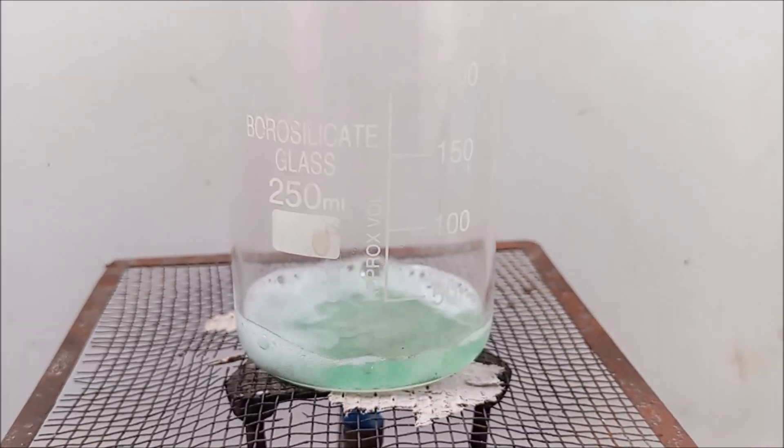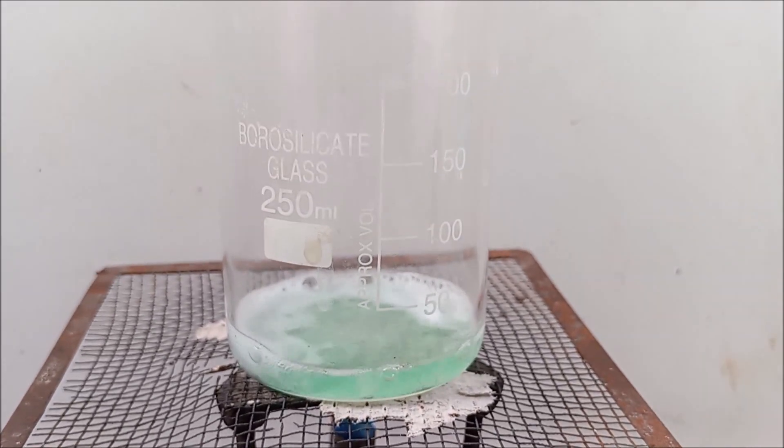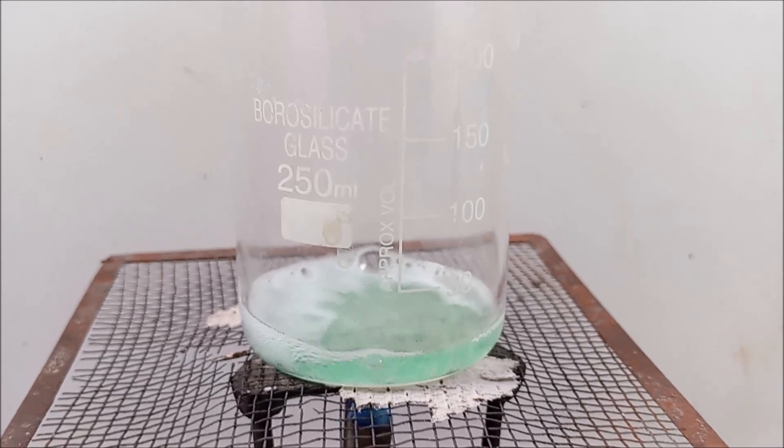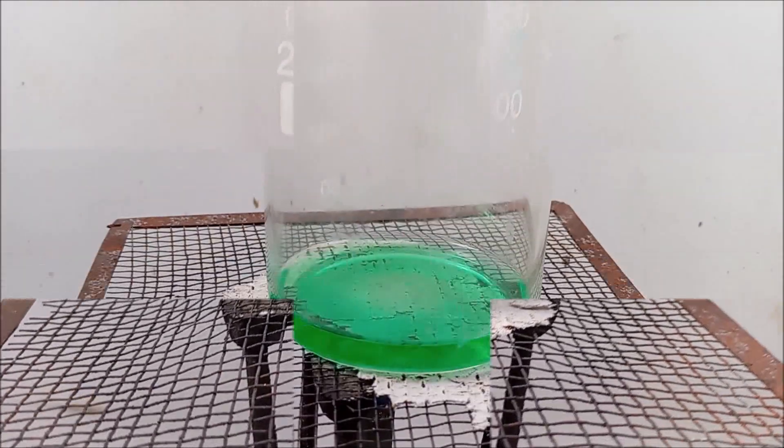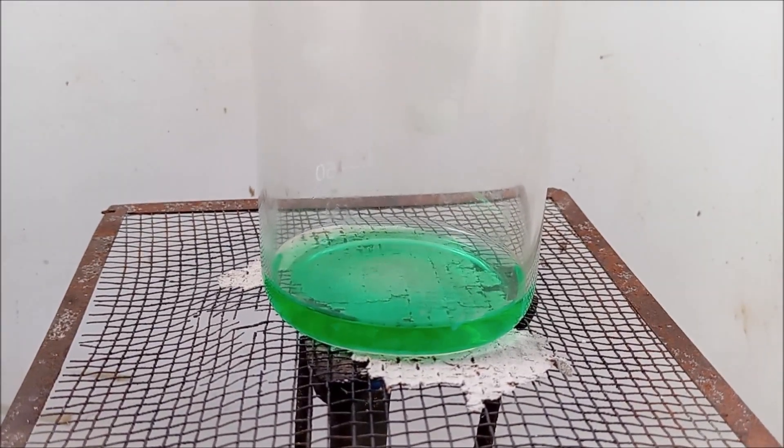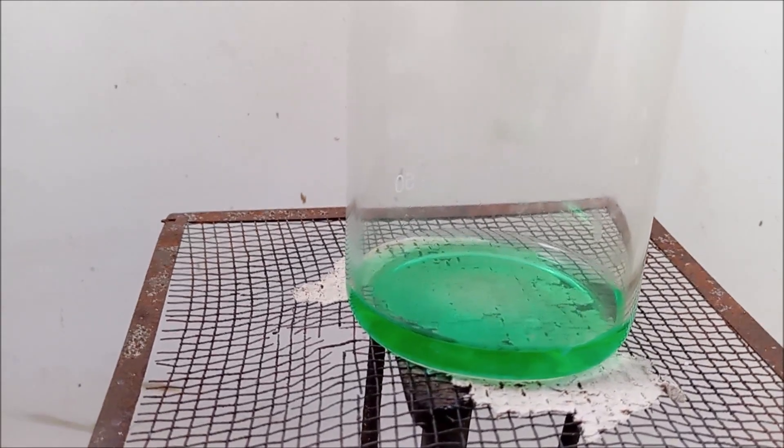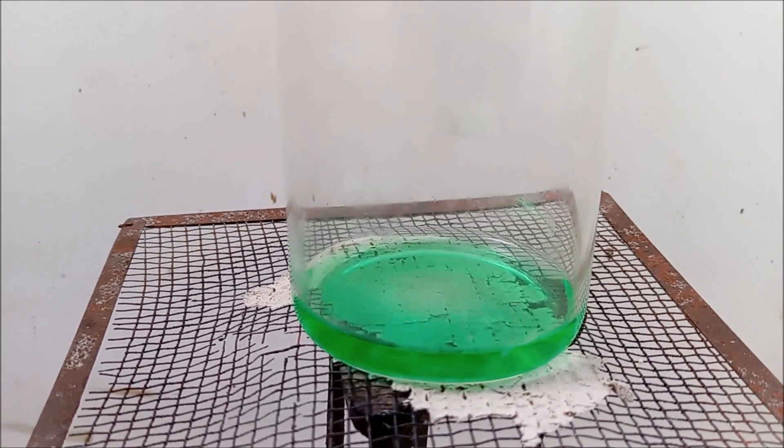Warming is sufficient. If the metal doesn't dissolve completely, warm it again after it reaches room temperature. Now the metal dissolves completely in acid. The color of the solution darkens a lot.